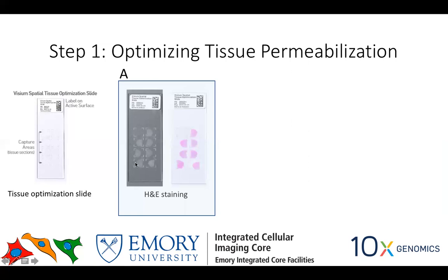So that's a bit of a challenge. So I would definitely advise people at Texas to practice this on a simple slide before spending their energy on an actual Visium slide, because once you make a mistake and you go and ask the Visium folks, they will be like, oh, you know, you have to pay for it. So just trying to save you some money over here.